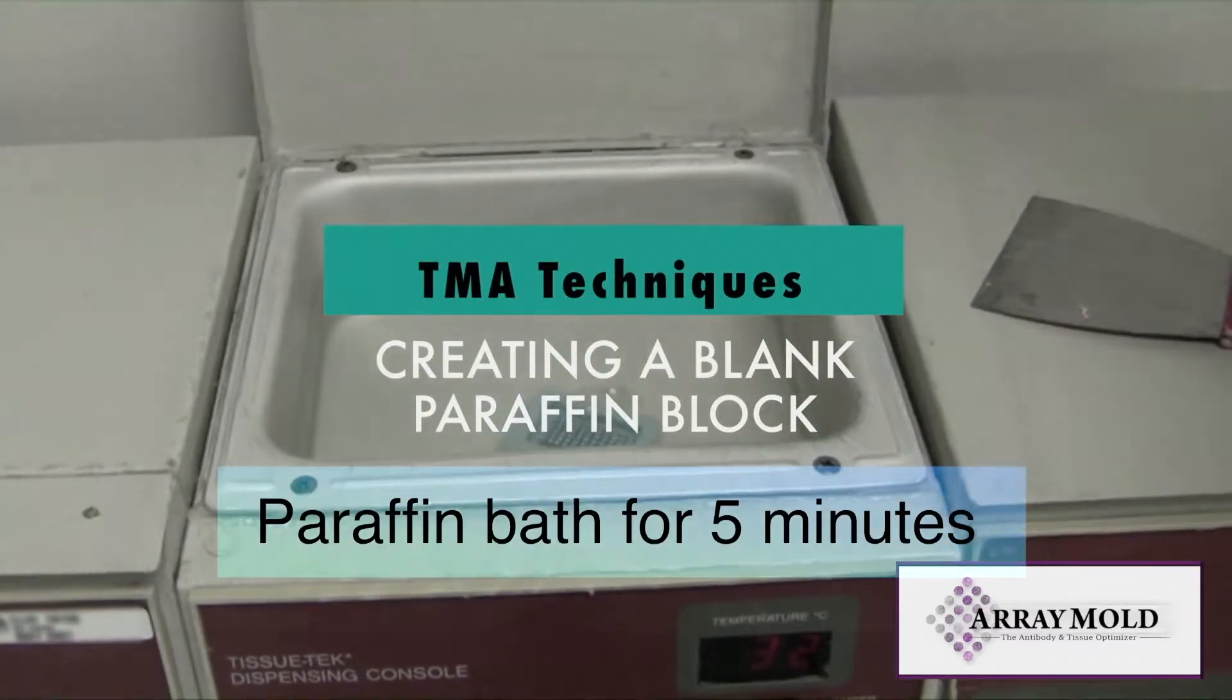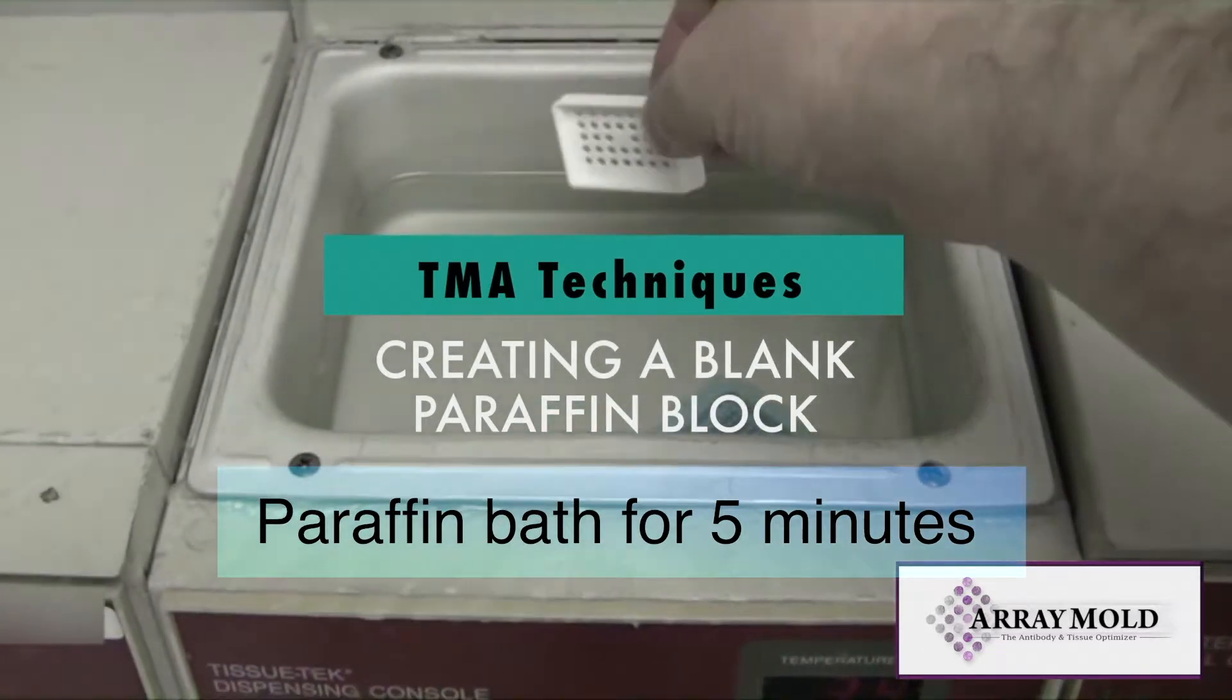Once your array mold is warmed up in a paraffin bath, place it on an ice plate or an ice tray and add the cassette.